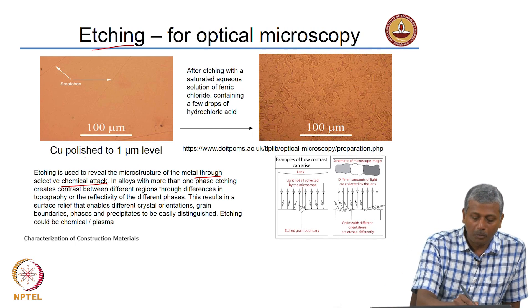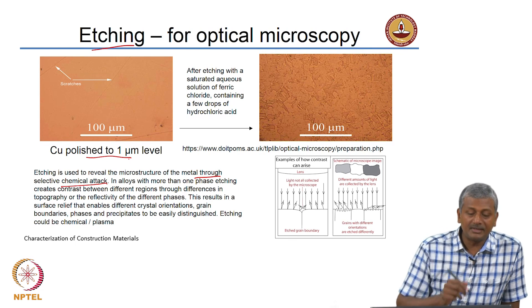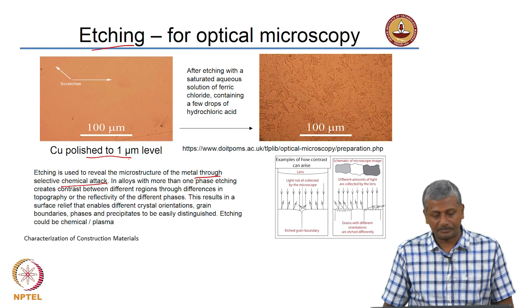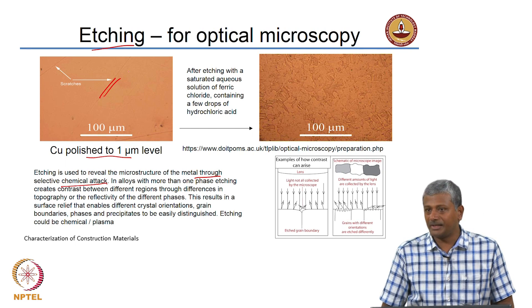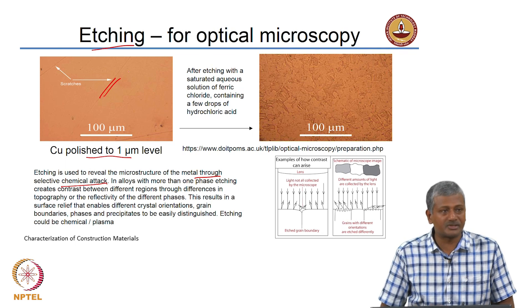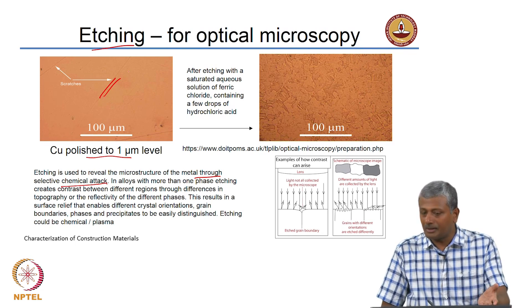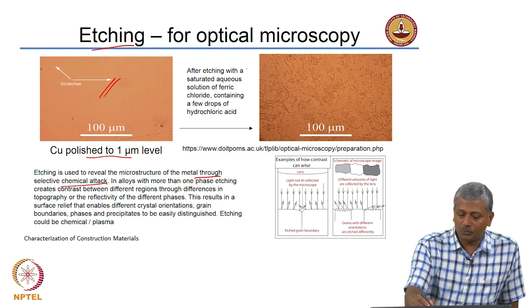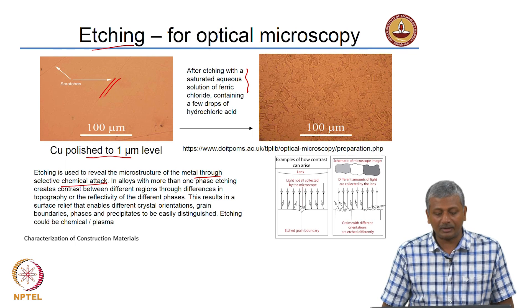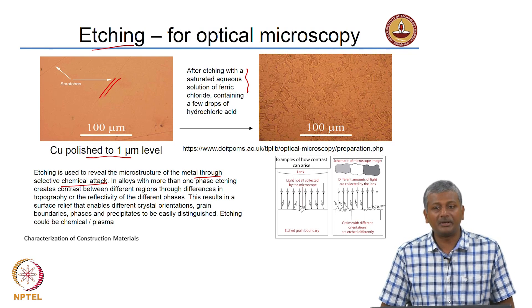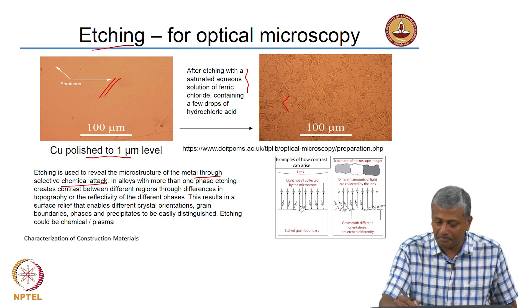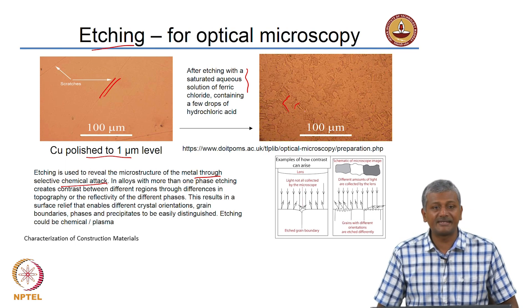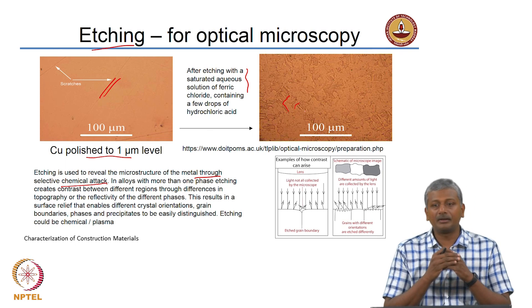For example, this is an image of copper polished to a 1-micron level as taken directly under the optical microscope. You see some scratches from the polishing — those are not grain boundaries or defects, they are simply scratches introduced by polishing. The same material after etching with a saturated aqueous solution of ferric chloride containing hydrochloric acid shows that the chemical has attacked some locations much more than others, producing crevices and pits at the boundaries between the different grains of copper.